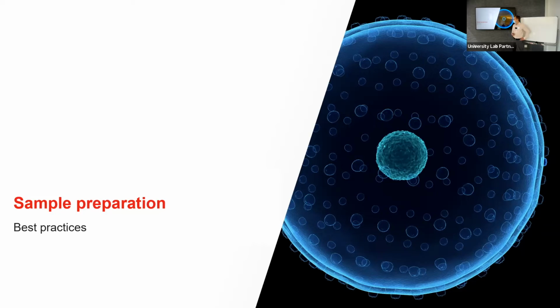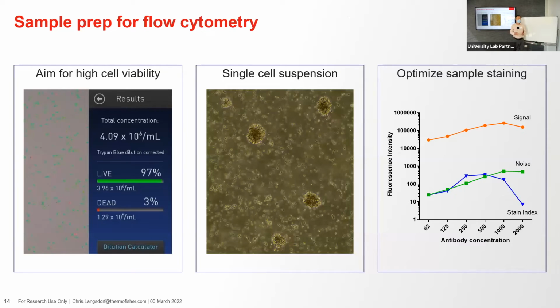So we can move on and talk about sample prep for flow, and generally strategies to have the best results when you're running flow, going from samples before you get onto the instrument, and best practices for that. So a few high-level strategies to look at.